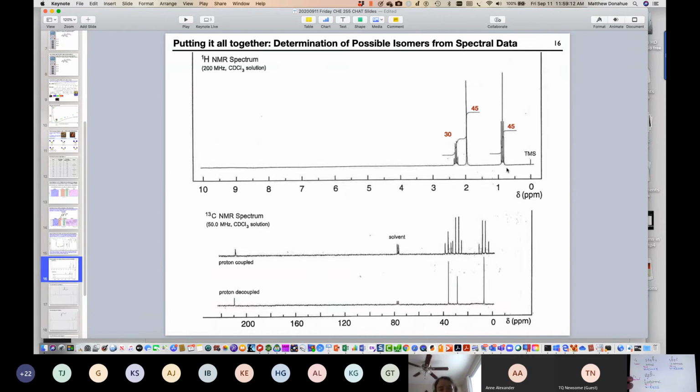So when I look at that data, I can say, okay, the data that is shown is not this compound, because that has 4. So it has to be either this one or that one, because it's 3. And again, all I'm looking at is, I see 1, 2, 3 unique signals.